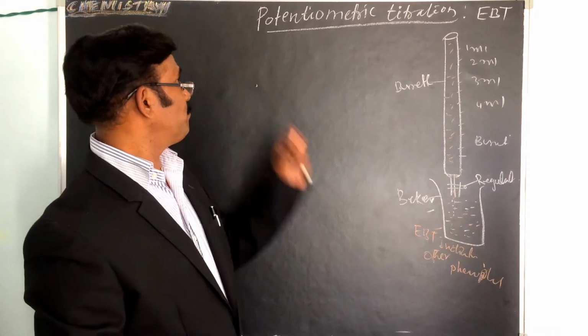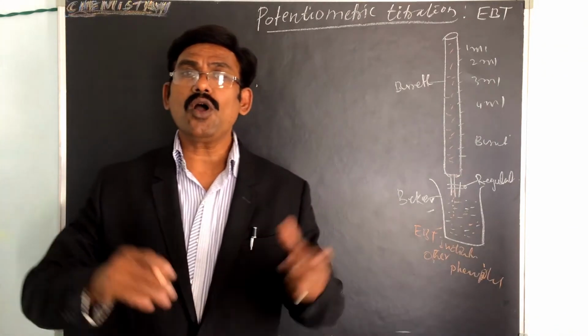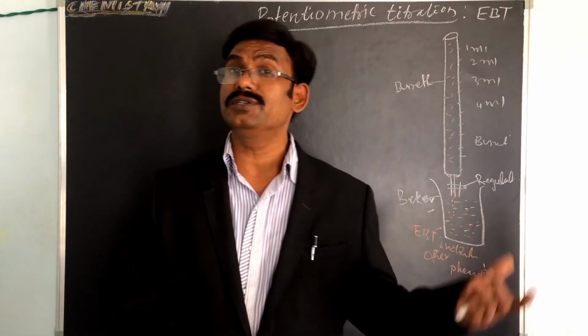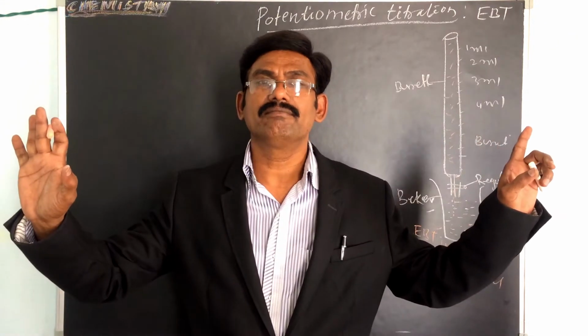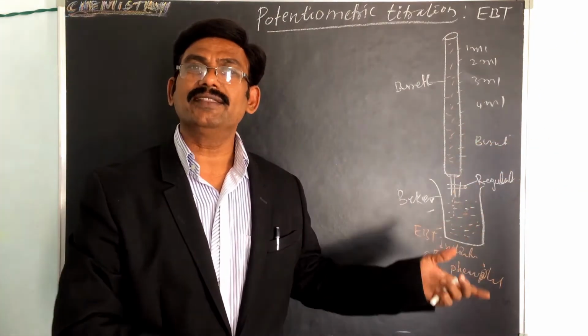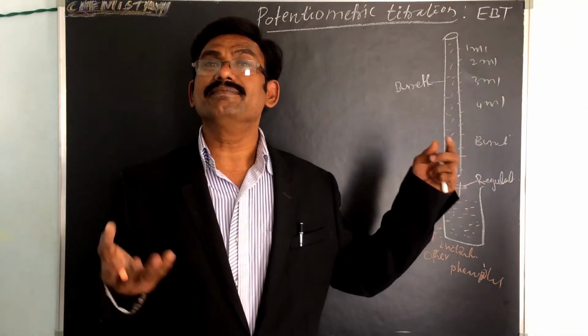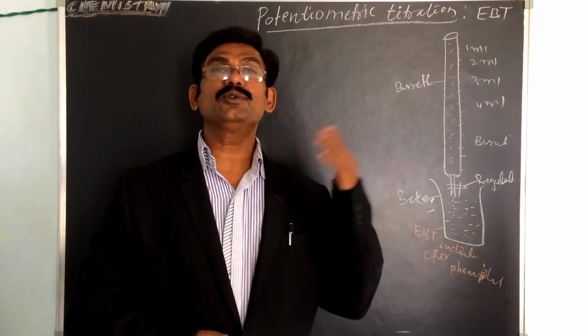But in the case of potentiometric titration, no indicator is used. Already we studied the electrodes, and the electrodes are useful.